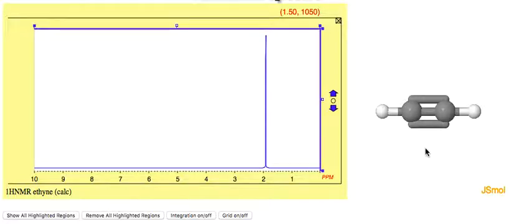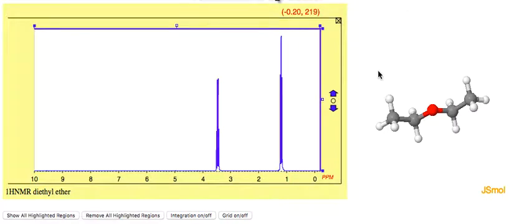On a triple bond, because of the geometry of the, let's see if I can spin this around. Because of the geometry of having the 2 pi bonds, it's actually not as de-shielded. It's actually back here again. Again, it's all about the geometry of all of these various spins, but they are, of course, equivalent, so you only get 1 peak.